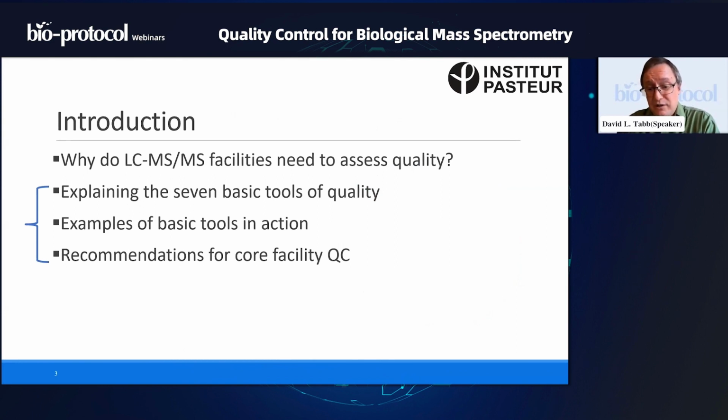So I'm going to start with a basic question, really. Why should LC-MS/MS facilities, people doing proteomics or metabolomics, really, why should they need to assess quality in their experiments? And what does it mean to assess quality in their experiments?